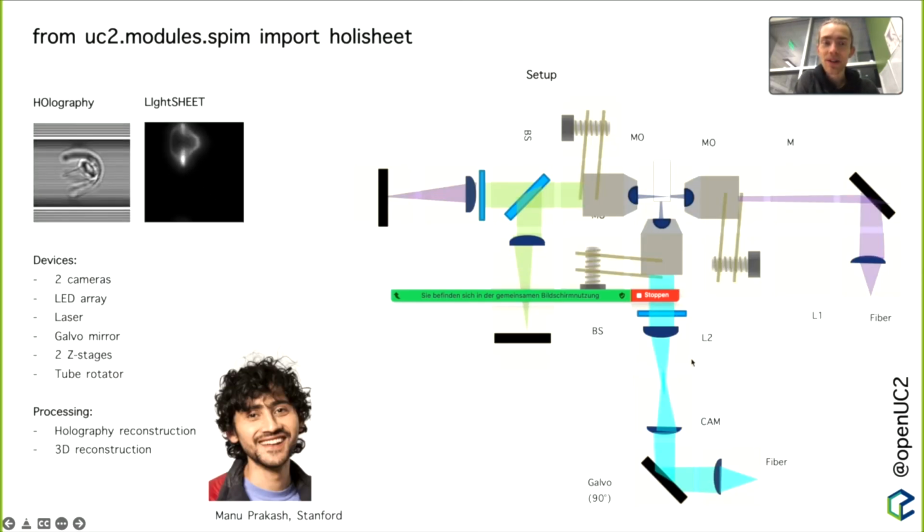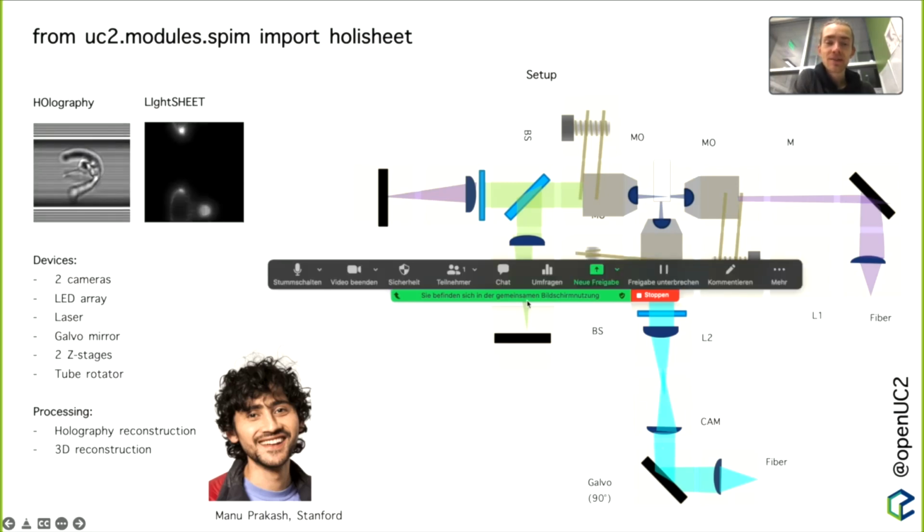And so how does it work? Our idea was that we wanted to continuously sample plankton from the sea in a microfluidic manner, so that what you see here in the simulation has a rotating capillary, so that you gather 3D information over time, and then a constant flow, so that you have the light sheet information from, for example, autofluorescence, and then also the scattering in terms of holography. And so what we have here is 2 different cameras for the 2 different imaging modalities.